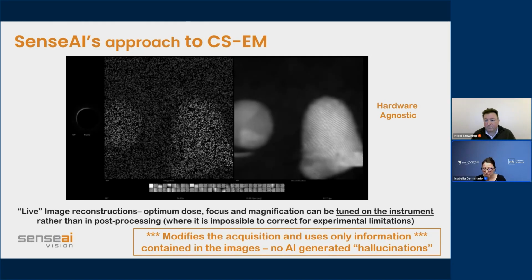Okay, thank you, Nigel. I think we'll revisit this third part of the question. There's another question here that I like. How have you done quantitative analysis on minimizing charging effect through sparse scanning, specifically in volume EM?